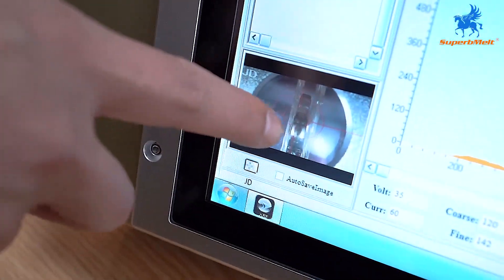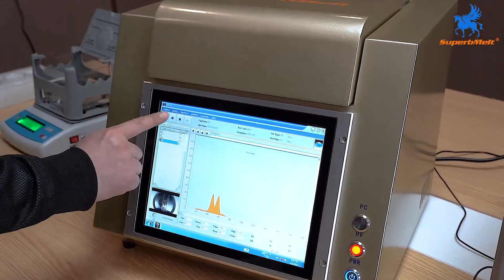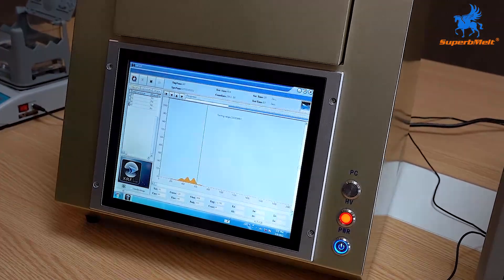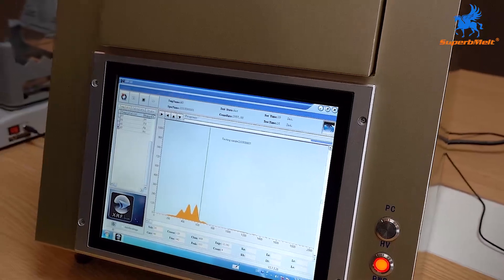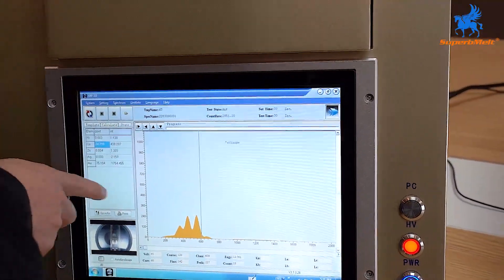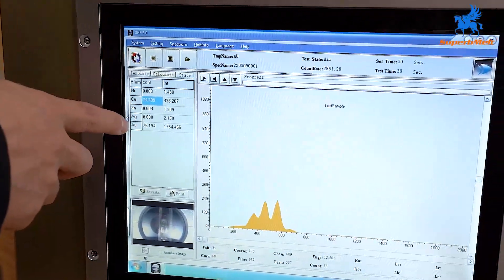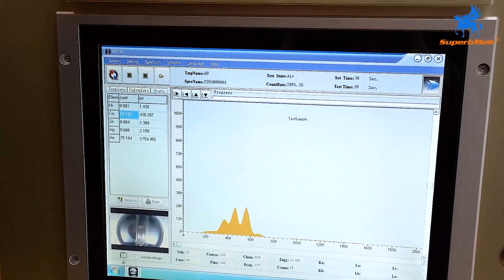The analyzer is pointed at the ring. It will take 30 seconds to analyze this material. The result shows the gold percentage is 75%, so this material is 18 karat. Copper content is also shown.